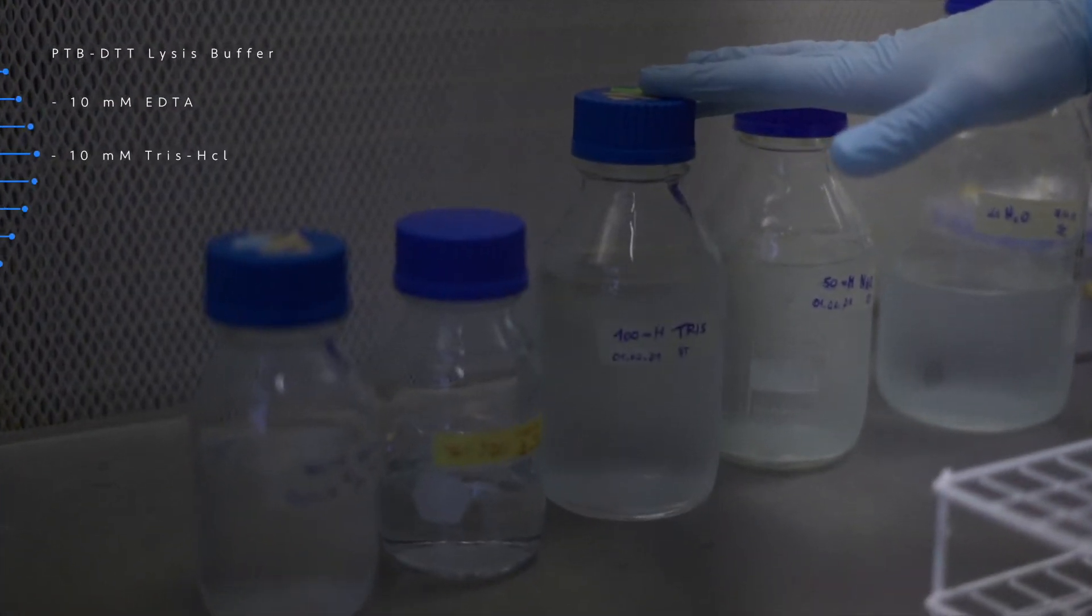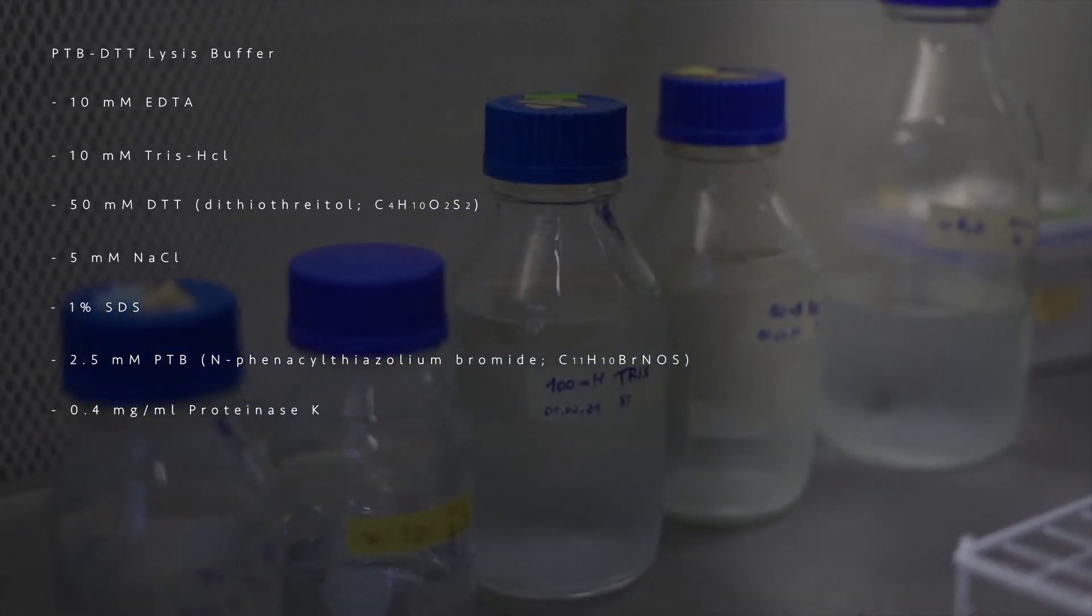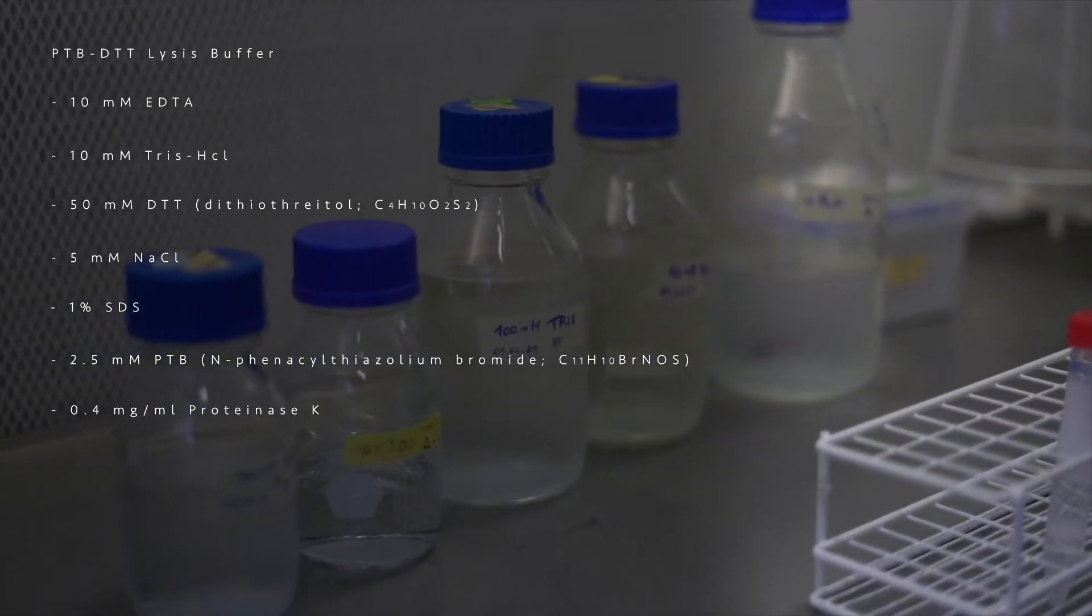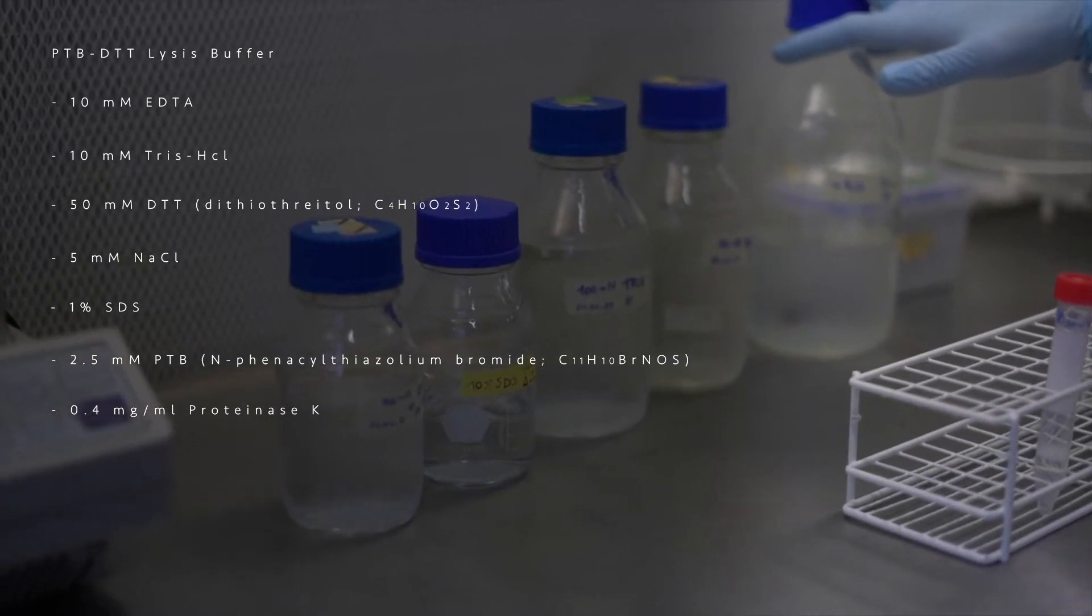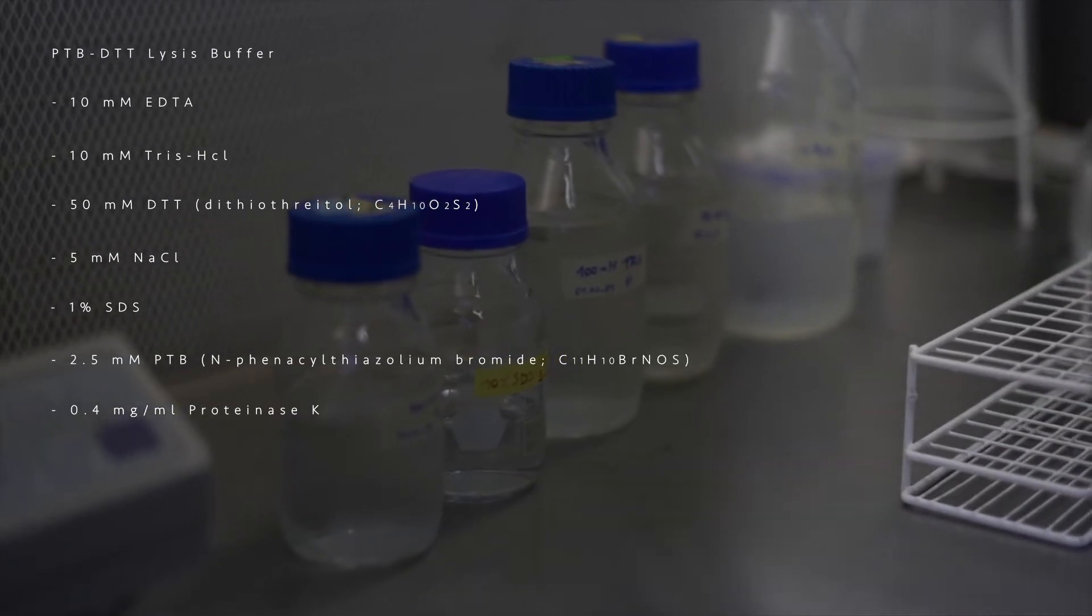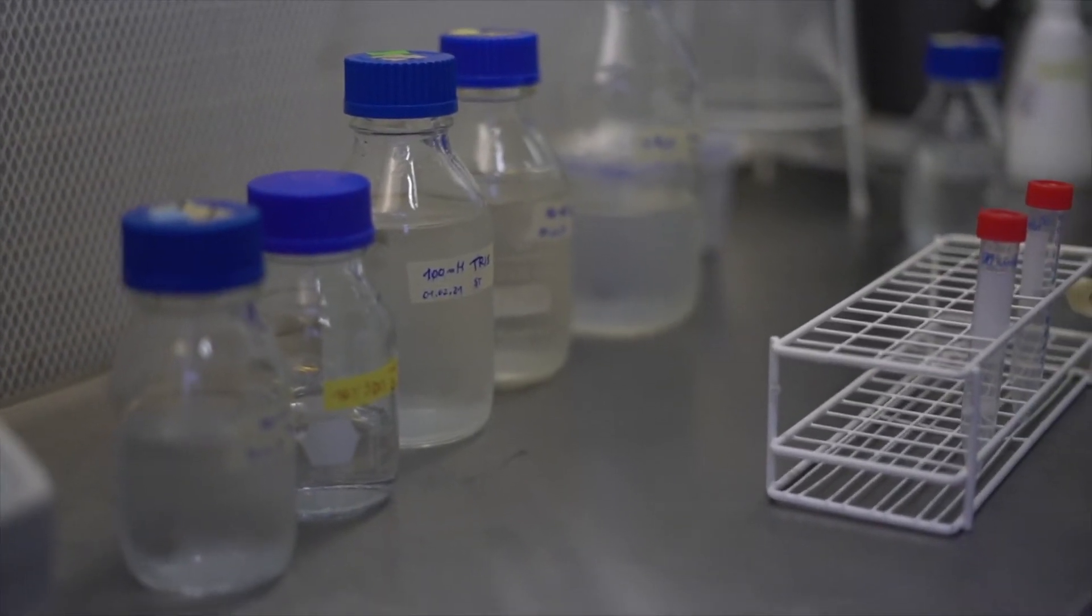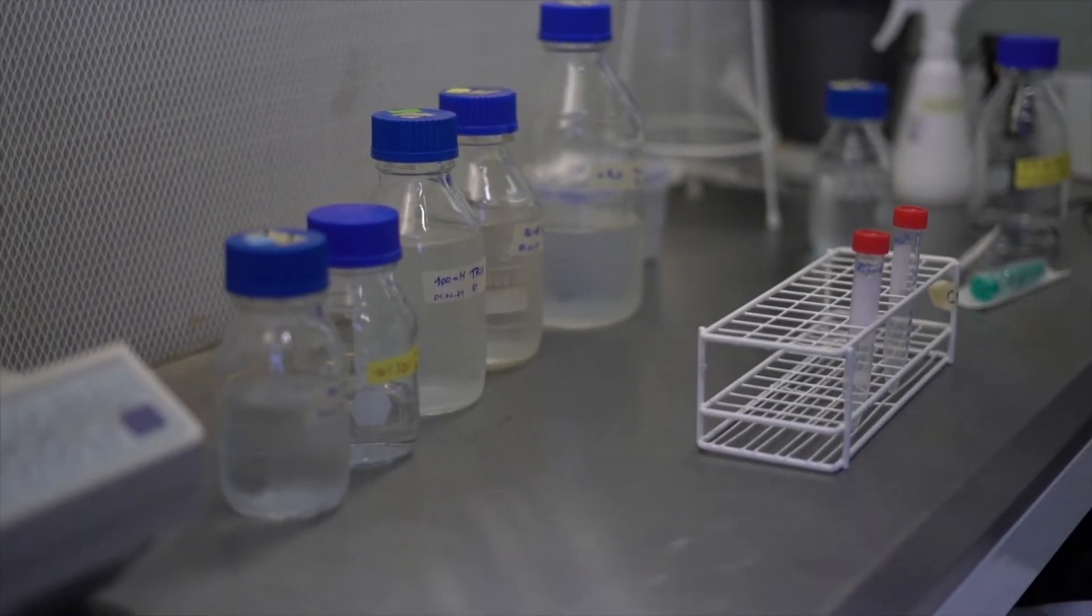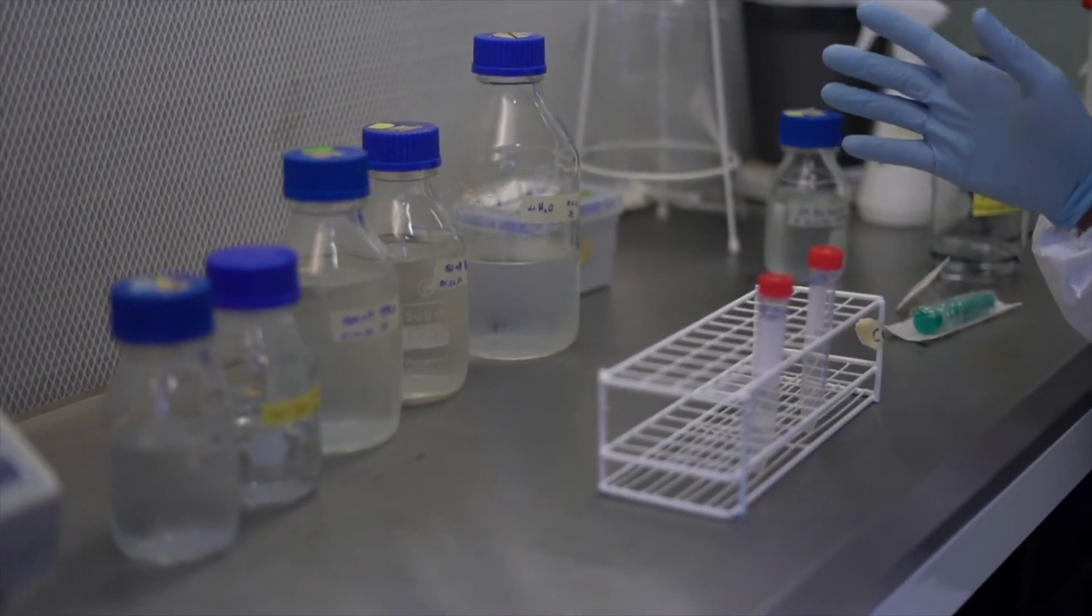You see the composition here on the video. That's how I prepare it. I prepare a 10-fold concentrated stock solution for most of the ingredients that I can store in the fridge or at room temperature for longer time. Then I'm going to mix them. After that I'm going to add two compounds that are more delicate: PTB and Proteinase K. Then at the end I'm going to adjust the concentration using millipore water.